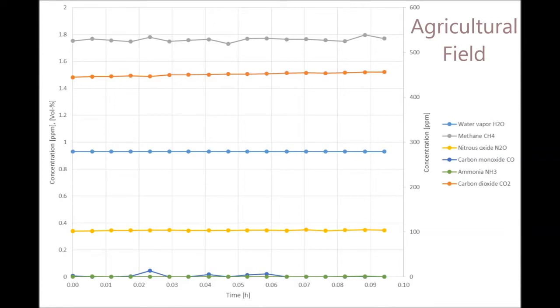On the agricultural field, the measurement time was much lower — less than 10 minutes. All the concentrations were really stable during the measurement; only some small fluctuation could be seen in methane concentration, and a tiny increase of only a few ppm in CO2 concentration.